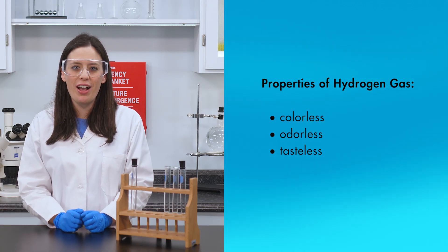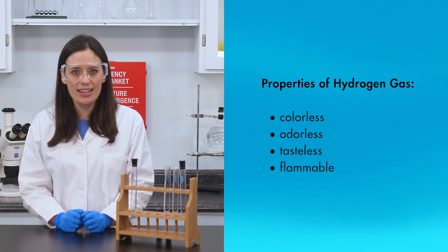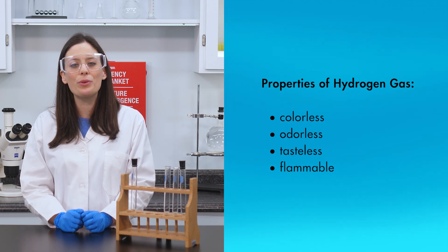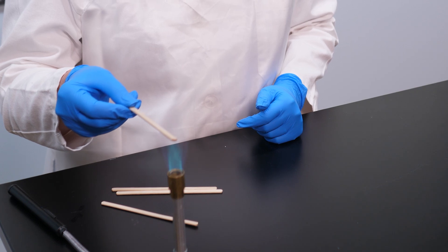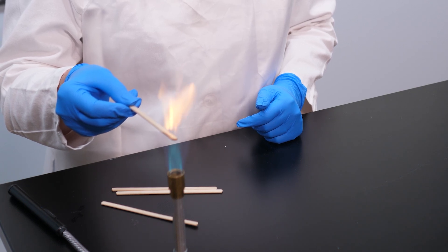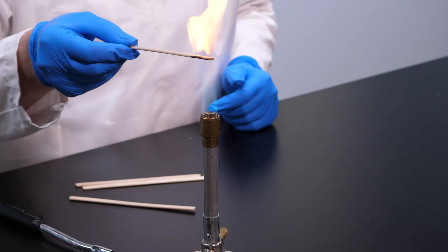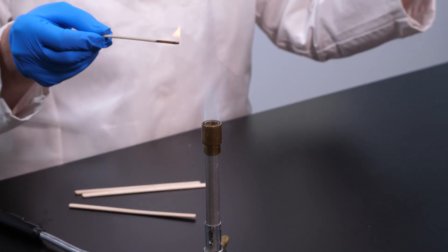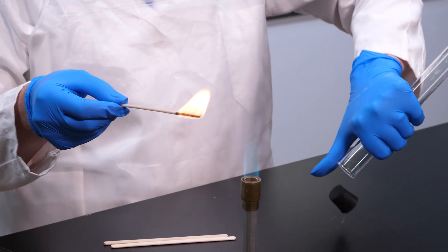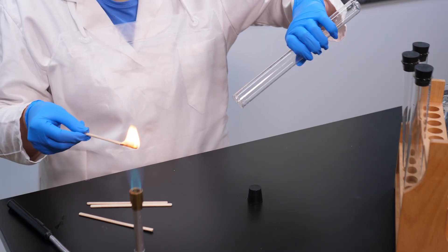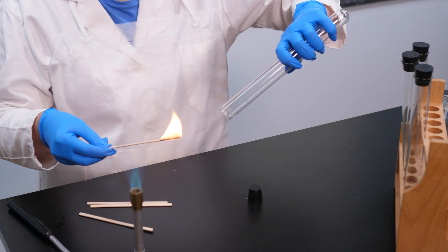One chemical property of hydrogen gas is its flammability. Hydrogen gas is extremely flammable when it mixes with oxygen. We can test the flammability of hydrogen with a burning wood splint. Since hydrogen is lighter than air, the gas will stay in the test tube as long as we keep the tube inverted. The hydrogen gas near the mouth of the tube mixes with oxygen and is ignited by the burning wood splint.